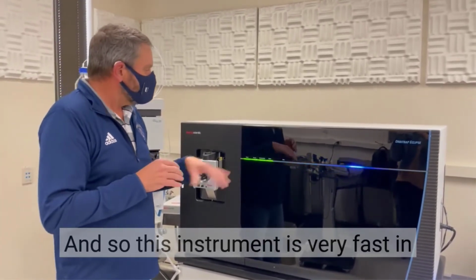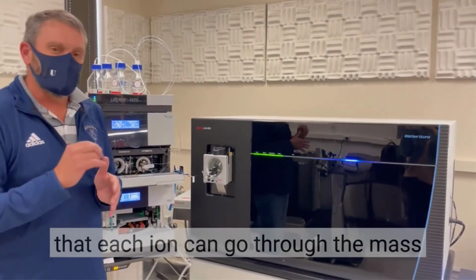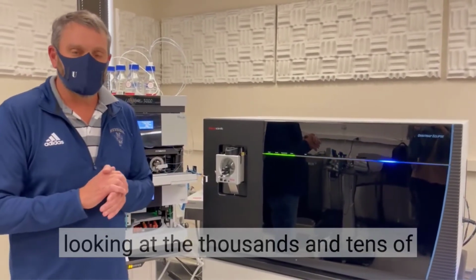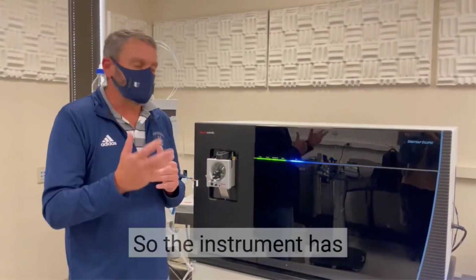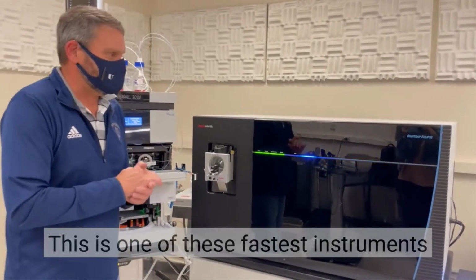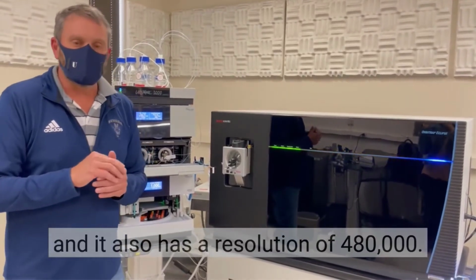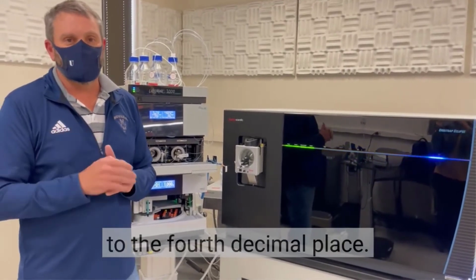This instrument is very fast. Each ion can go through the mass analyzer in microseconds, but we're looking at thousands and tens of thousands of ions at any given time, so the instrument has to be extremely fast. This is one of the fastest instruments on the market, the Orbitrap Eclipse. It also has a resolution of 480,000, so we can actually see down to the fourth decimal place.